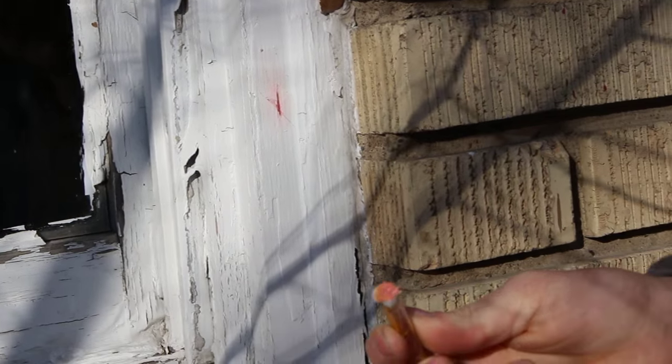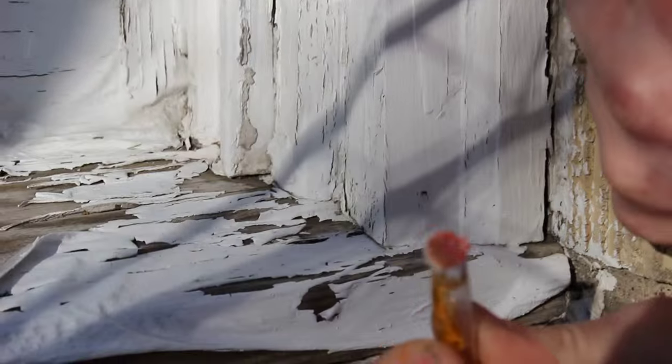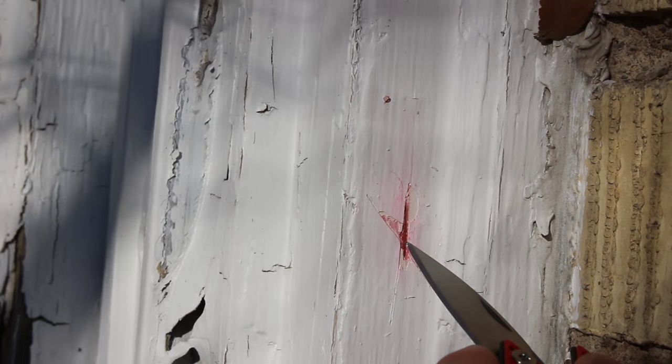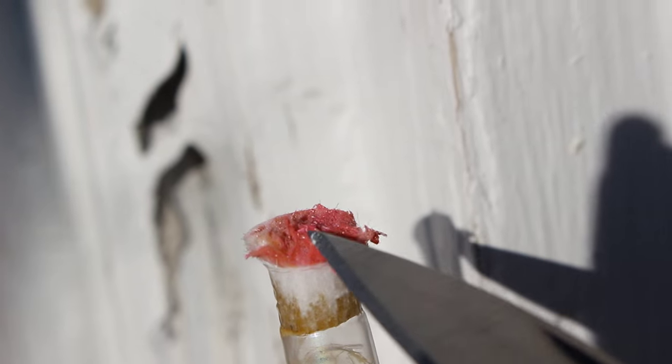Okay, I definitely see some red color. It looks like the paint underneath this outer one actually contains the most lead. See how it turned a nice pink color in there? That's definitely lead right there.